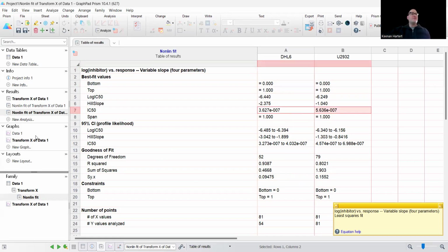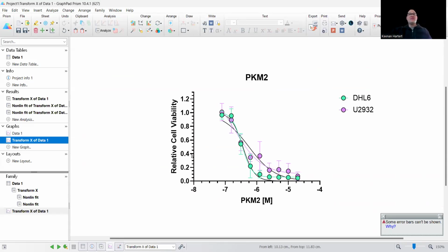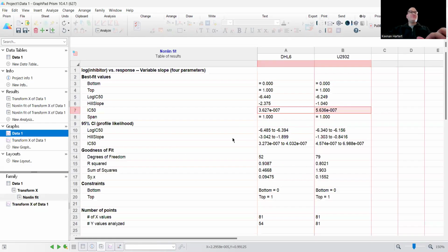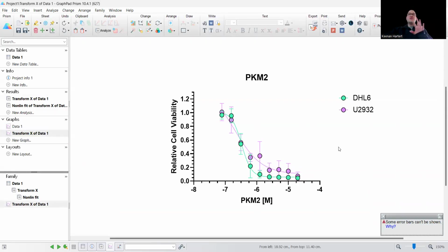Now, given our data was actually pretty clean in this case, oh, not that one, remember. It's actually probably pretty close to what it is. But see this black line that we just added, since we didn't do any aesthetics for that, that's when it is forced to go through 1.0 and kind of end at 0, at least for its analyses, to say the exact middle of that will be 0.50 survival. Now, in this case, I would usually grab that data and then get rid of, for example, the second curve in there. So this is what you would want, just for your poster, for example.